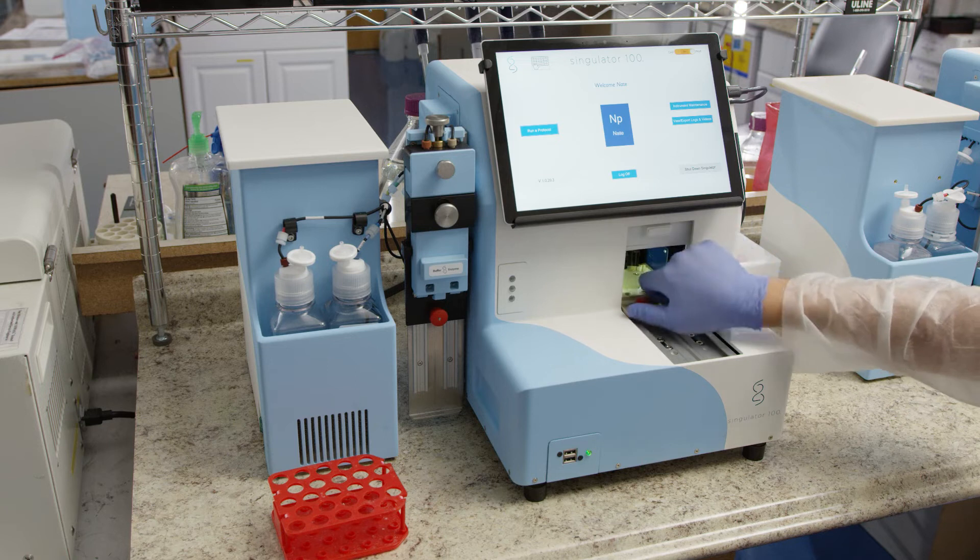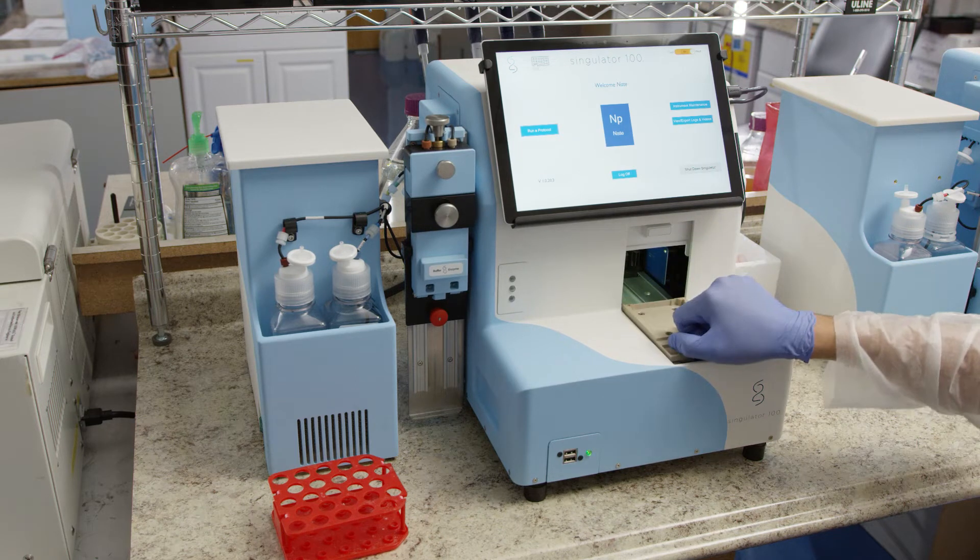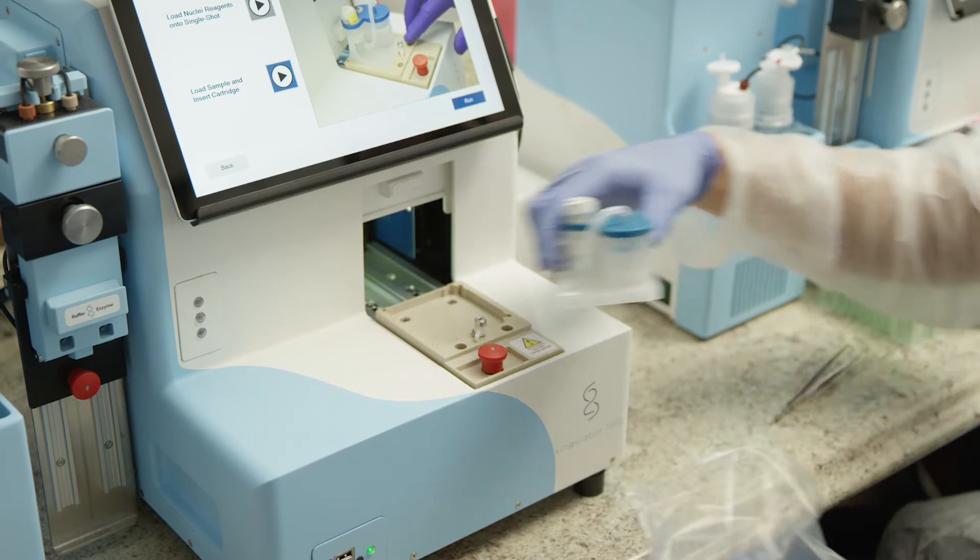When the system has reached temperature, open the door in the front of the Singulator. Lift the red knob to release the sample stage and slide the stage out of the Singulator.